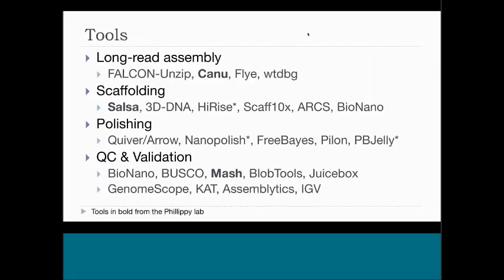Yeah, good question. This is a very hard problem in the absence of a reference genome to tell which assembly is best. So I would say the easiest thing to do is to get complementary lines of evidence that you can use for validation. For structural validation, I like to rely on optical mapping as a crutch, comparing the final assembly versus the optical map assembly and looking for differences, and I find that very useful. Similarly, you can look at Hi-C maps now and see which Hi-C map looks more correct in some of the final assemblies.